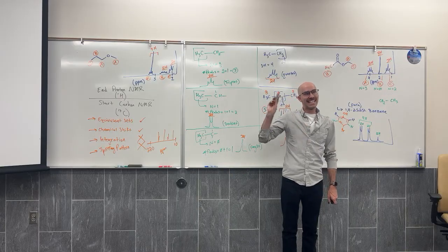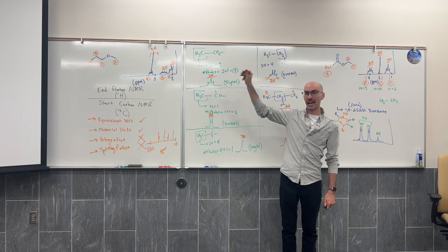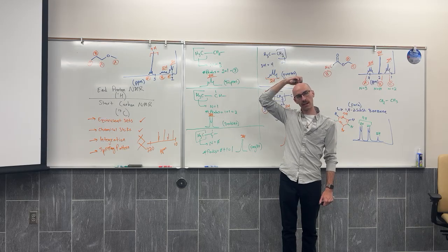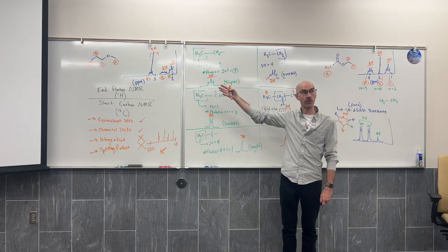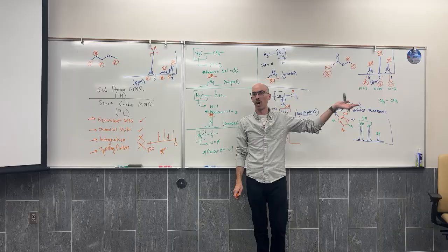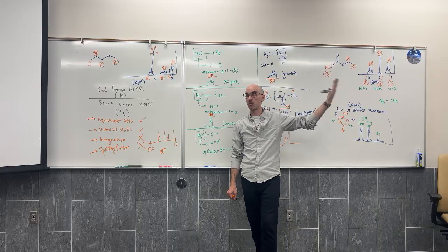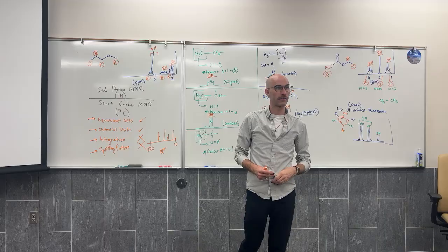Also, 99% of hydrogen nuclei are the isotope that is NMR active, but only, I think I have that backwards, 1.1% of carbon nuclei are NMR active.